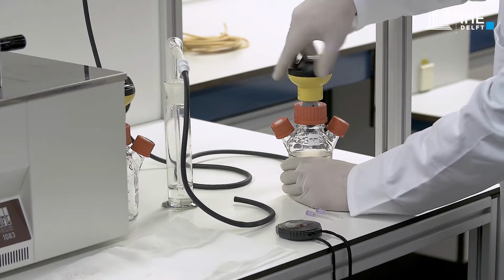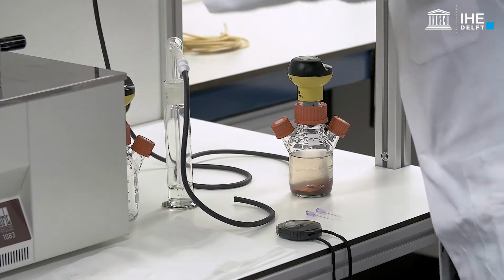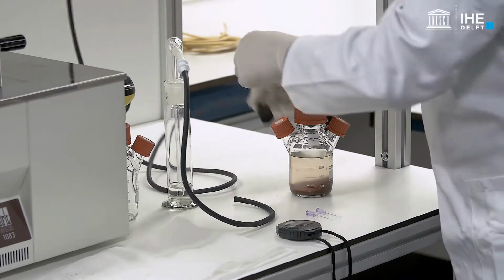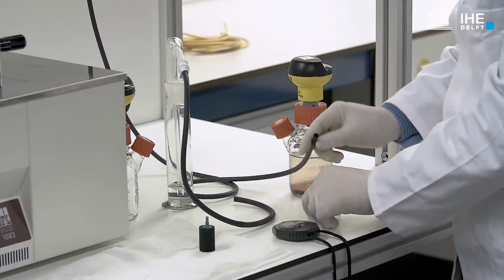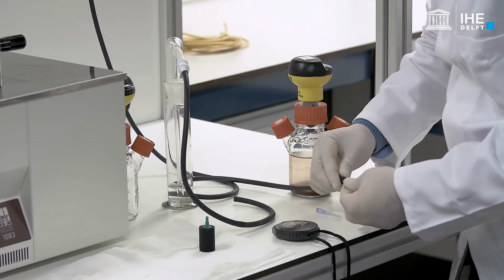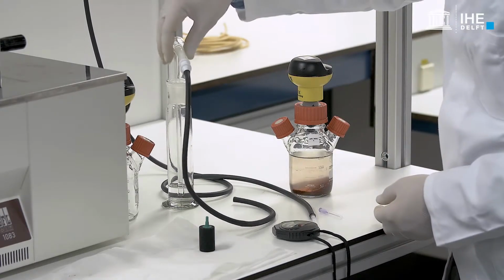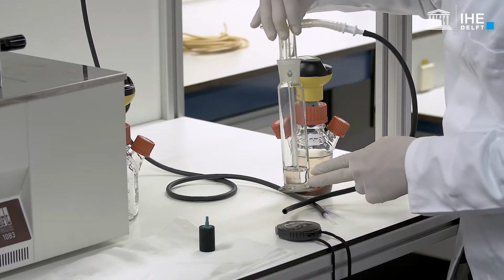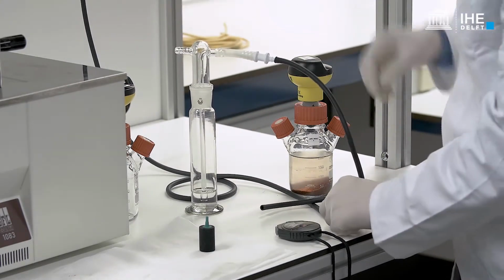Close the reactor vessel and flush the headspace for 5 to 10 minutes by connecting the nitrogen gas supply and a water lock, respectively, with needles inserted into the lateral openings. The water lock has a water column of 2 centimetres, corresponding to a relative pressure of 2 millibars.